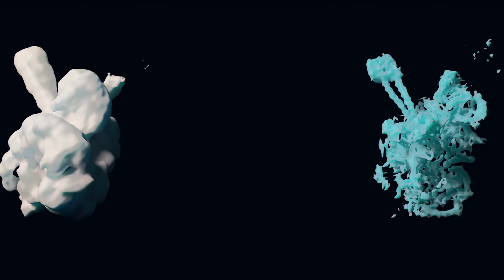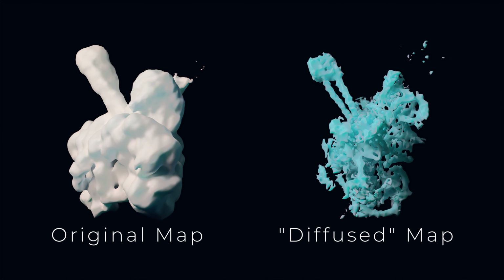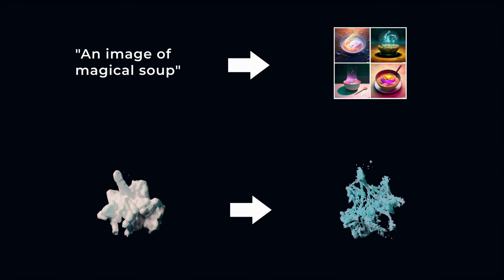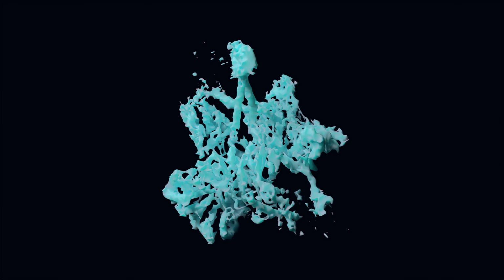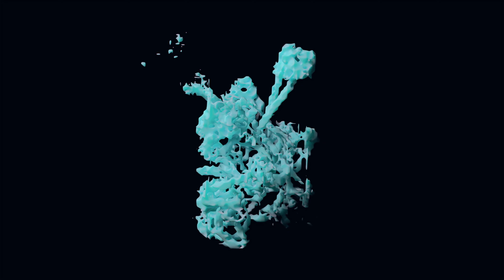It begins by emphasizing the backbone of proteins in cryo-EM maps using the diffusion model. Similar to how DALL-E generates an image given some text, this model generates a new refined map where the backbone density is more apparent given the original map.